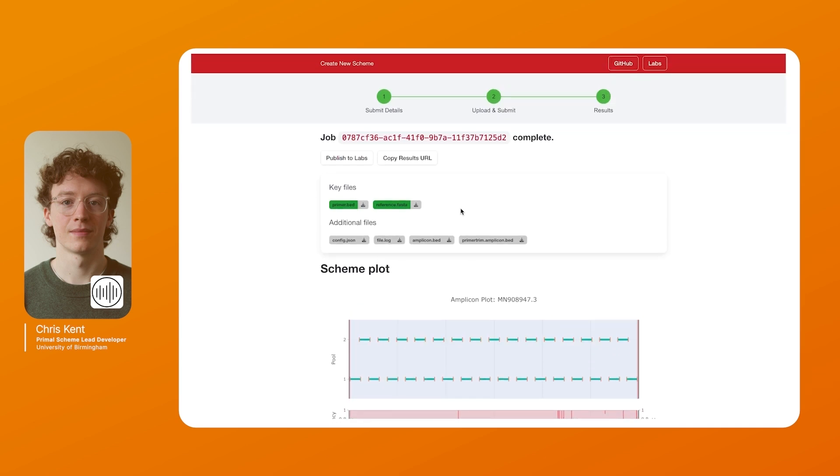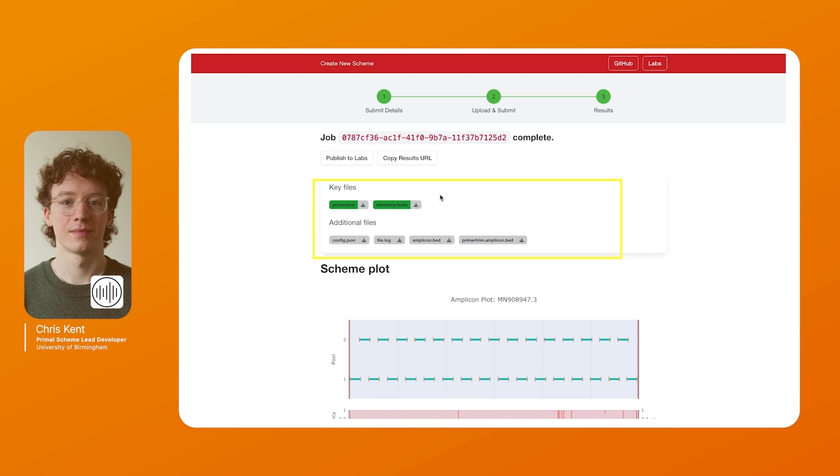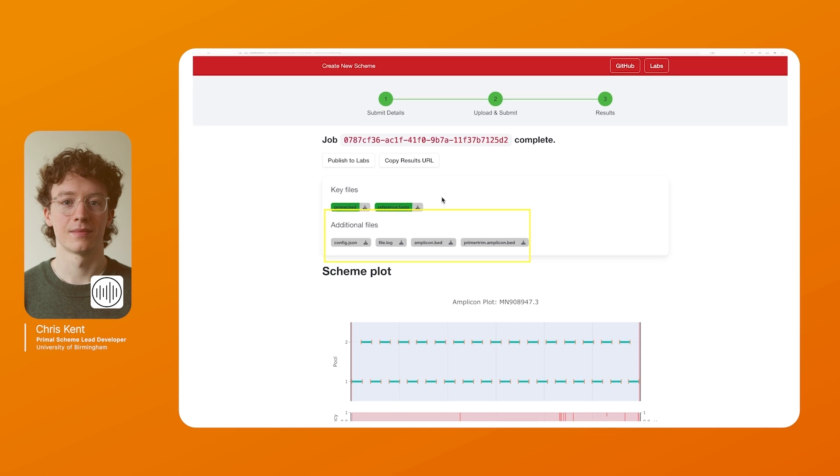For the key files we have the primer.bed file which contains the primer sequences and their locations in the reference genomes. We also have the reference genome file used for analysis. We also provide access to some additional files which most users will not need however they can be useful for troubleshooting. We have the config.json which contains detailed parameters. We have a log file which contains the information and we also have the amplicon file and also the amplicon file with the primer locations trimmed. These can be useful for downstream analysis or troubleshooting.